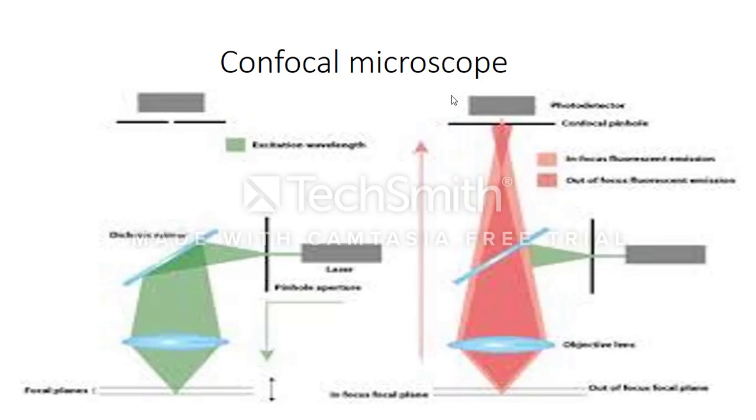Scientists recognized that jellyfish could glow in the dark when blue light rays were shone on it, and so they isolated this GFP protein, which enabled this to happen. And what they did was they linked it to a fusion protein, which is the protein of interest in whichever cell we're trying to look at.